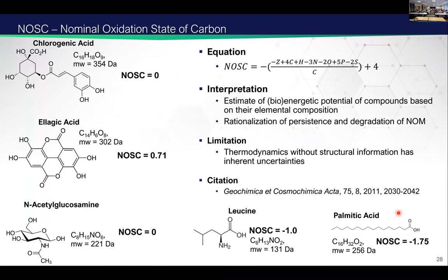I strongly encourage you to have a look at this original paper from 2011, which introduced the concept. They explain their methodology and rationalization, all looking at half equations and redox potentials of all sorts of different species. It's a very powerful technique, but again, it's one of these things that I find takes a little bit more thinking about to interpret than some of the other ones like double bond equivalents, which are much more straightforward.